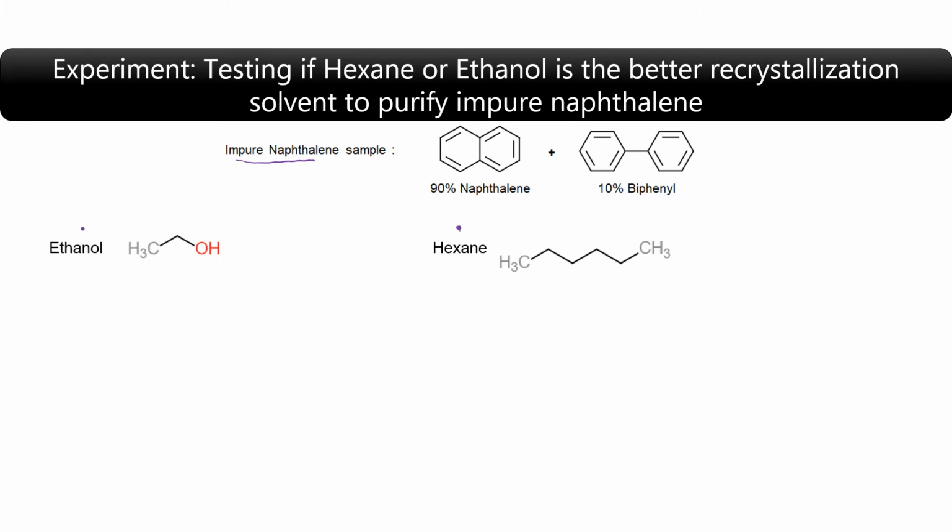So the better recrystallization solvent should be able to have a better recovery of the pure crystals, and also the purity should be higher.